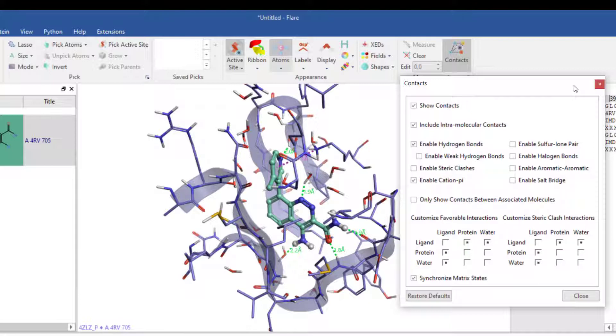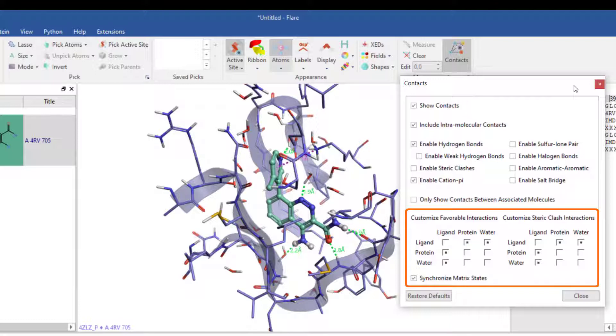The matrices at the bottom of the window can be used to further customise the contact and steric clash interaction display, including making the contacts bold.